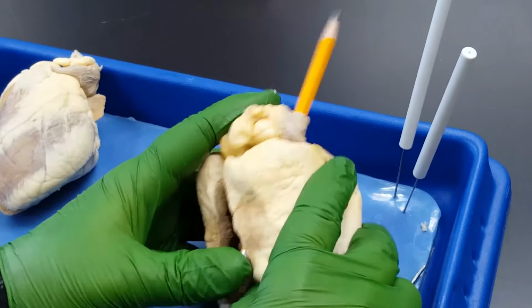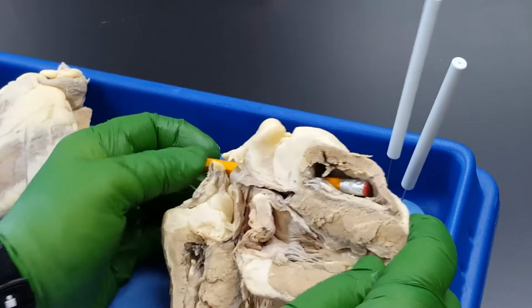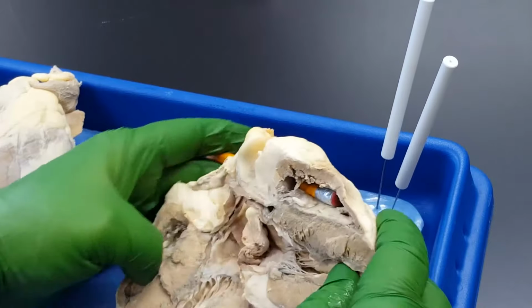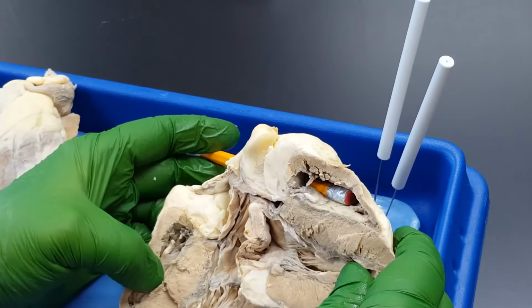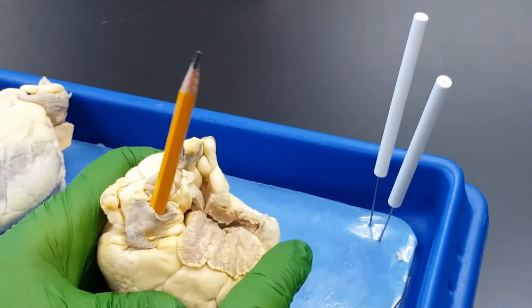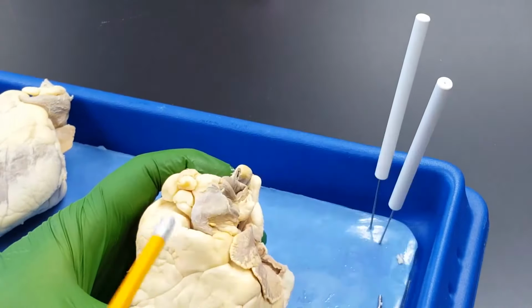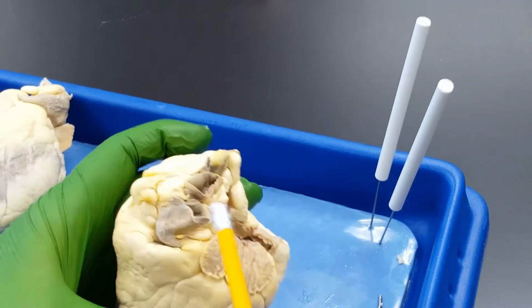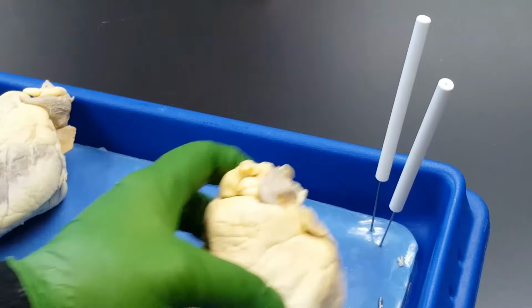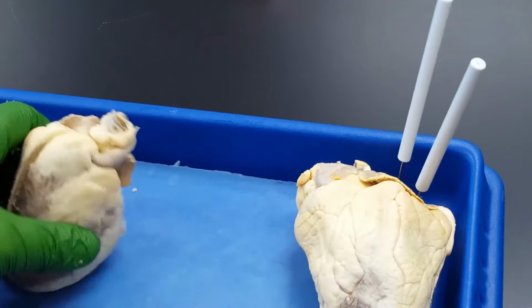So as I open this up, where's the tip of my pencil? Look at the thin wall, in the right ventricle. In the right ventricle. What great vessel exits the right ventricle? The pulmonary trunk. That makes this the pulmonary trunk. So the only way you really know that is because of where the pencil ends up.